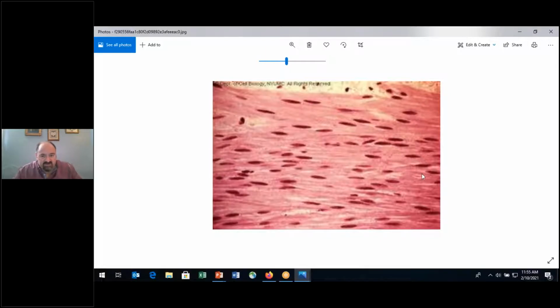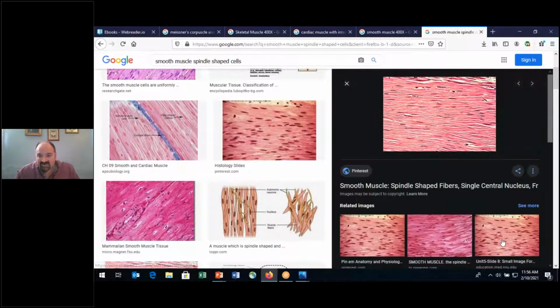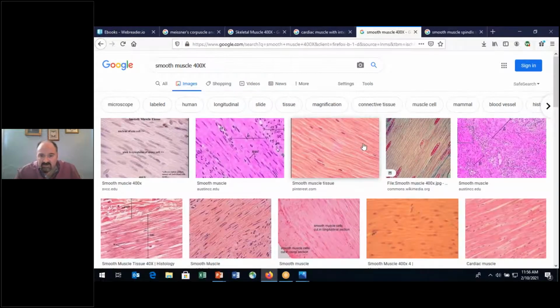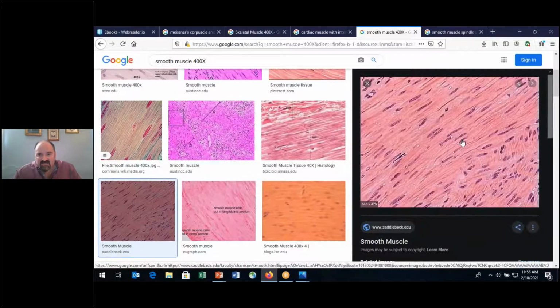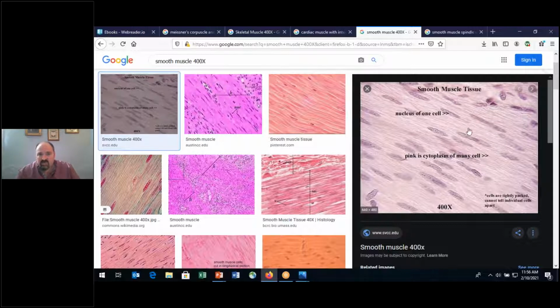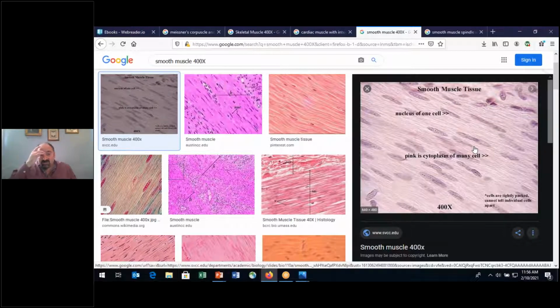You can see a little bit of the differentiation, it's hard to notice, but you can see this right here. But primarily, if you just notice that, hey, those nuclei look like they've been stretched, that's smooth muscle. Okay, that's a major indicator for smooth muscle. Here, see those? So on this image, it looks like those nuclei have been stretched a bit. Smooth muscle. That's the kind of presentation I show when I'm testing my students, so that you know that, hey, that looks different from what I've seen with the other samples, and those nuclei have been stretched. Smooth muscle. Okay.